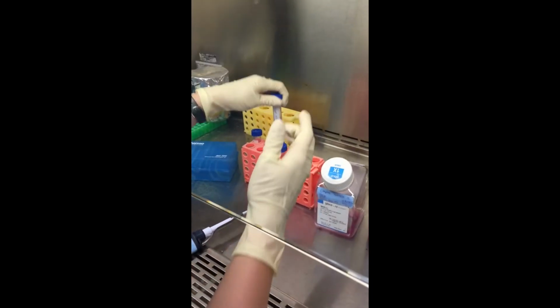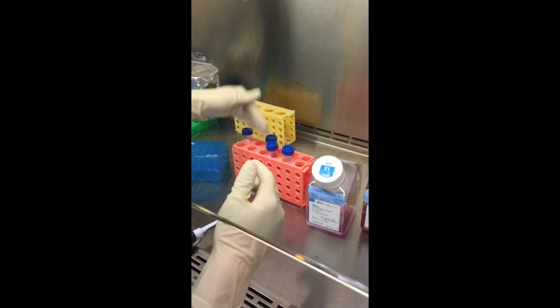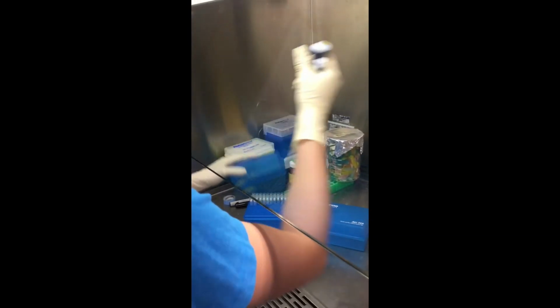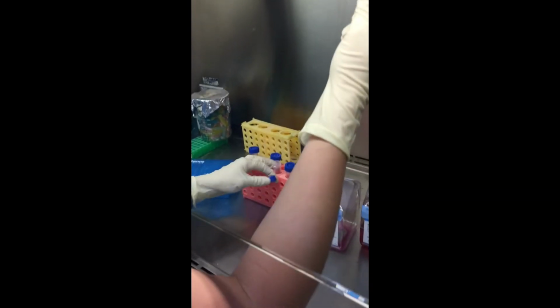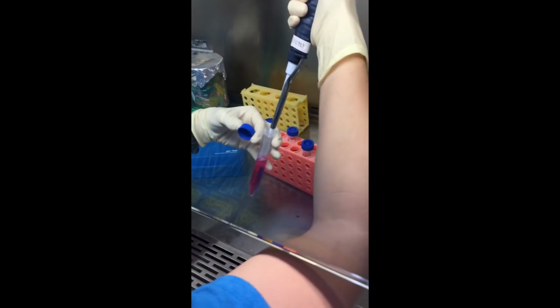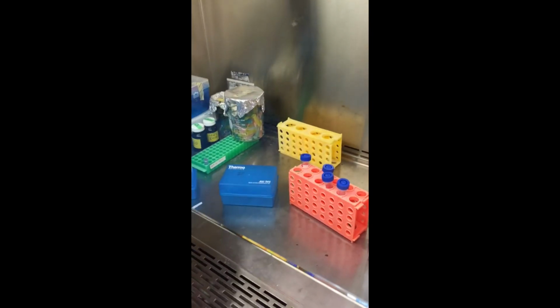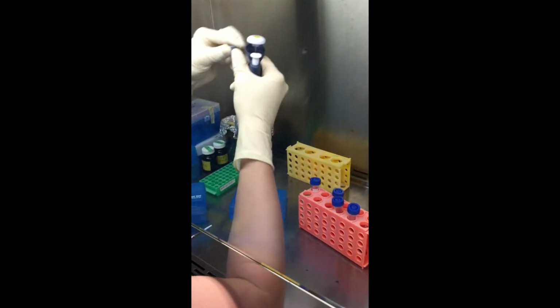So that one's complete, and I like to move them back once they're complete and tighten the lid so I don't get them confused. The next one was 32 microliters. Again, I'm going to take out 32 microliters and get rid of the tip, and then put in 32 microliters of my drug.